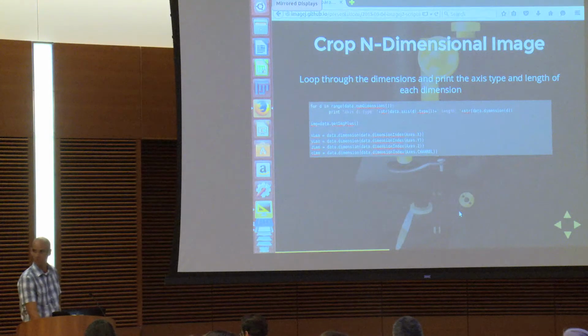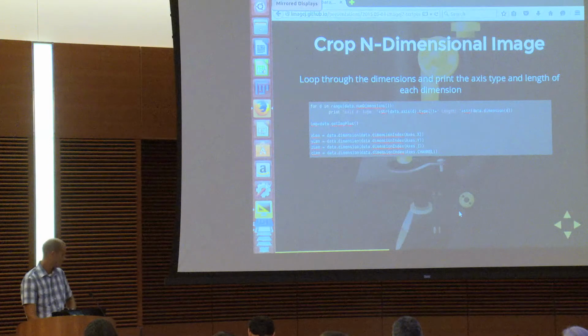The fact that we have to use IMG in some places is actually to work around a limitation. We only asked for one, so it would be the series axis. The active series is what we open, because that's the one that's active, that's what's going to stay in there. The fact that we have data and IMG is unfortunate, and that's not the goal, because you want to essentially unwrap it. And supposing I get two images, one data set and another data set, then it wouldn't work, right? Because there's no such thing as two active images.